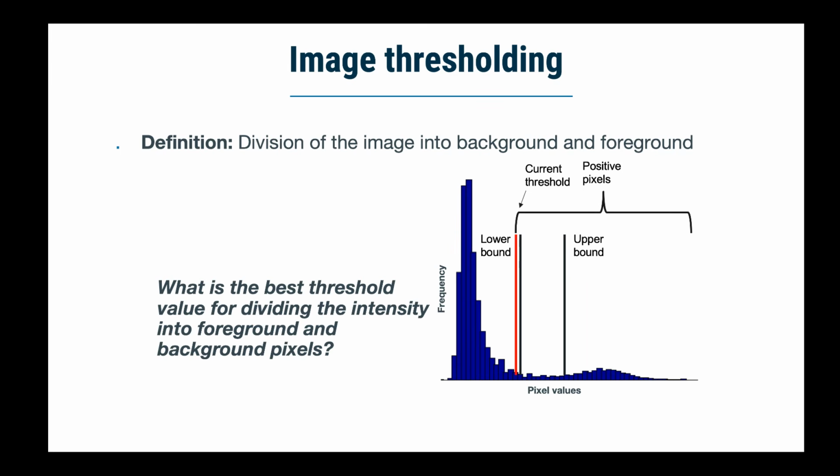But if CellProfiler decides to put in a threshold based on the pixels that are present that is outside of our bounds, in this case, it's too low, but it would also do the same thing if it were too high, it gets rid of that threshold and sets it to the closest bound.